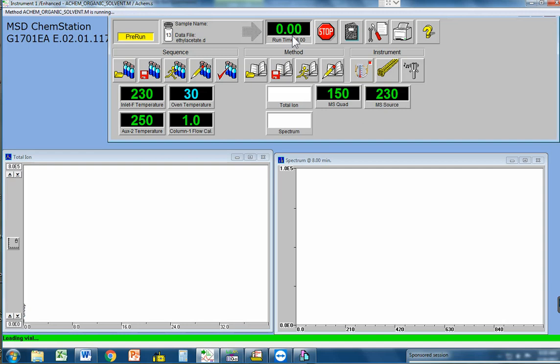And then in 15 is a mixture of 1/3 volume per volume of the 3 different samples. So it's a mixture of all 3 of them, where all 3 volumes are equal, right? For example, to make that sort of a sample, 1 ml of each of the solvents is in that sample.